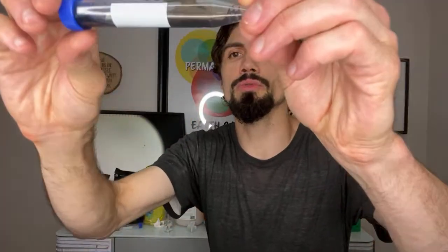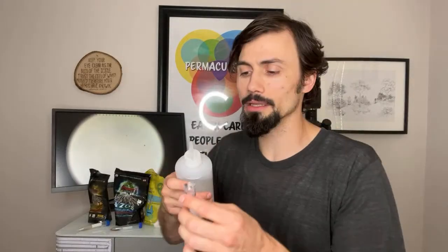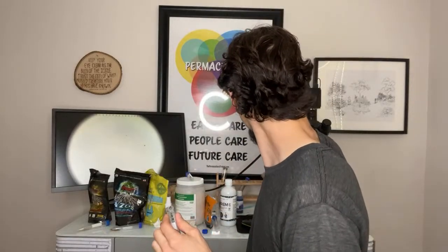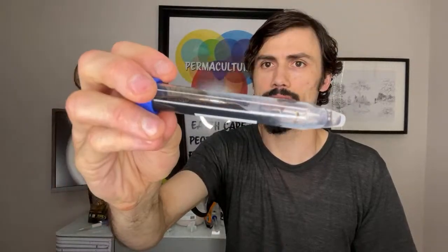Let's do Recharge. The molasses in it is part of the reason why it works so well. The microbes come with their sugar supply already with them, and molasses has a lot of nutrients in it. I'm actually gonna dilute this a little bit so that we can see it more easily. Everything else is down to the milliliter. Yeah, it's just because of the molasses. It's really dark, and you sandwich it between the cover slip, but it turns literally golden.